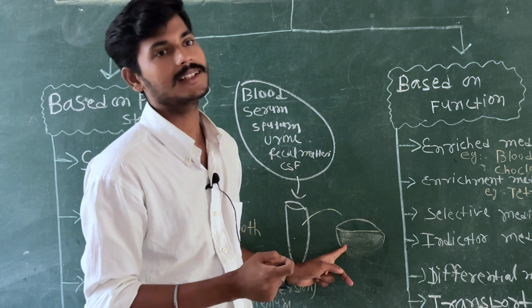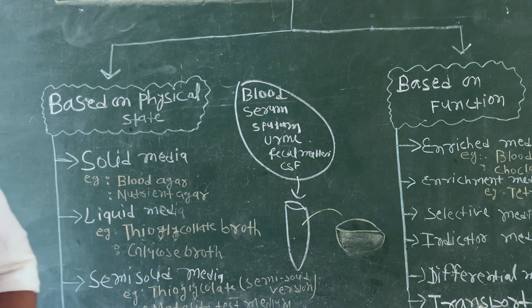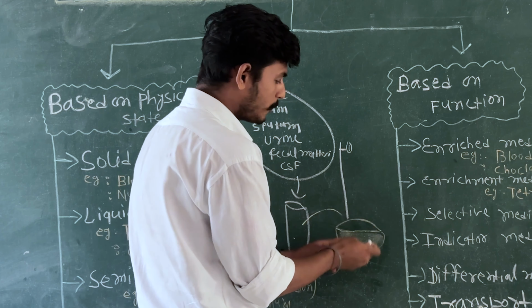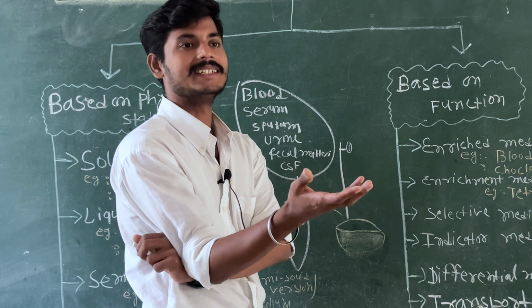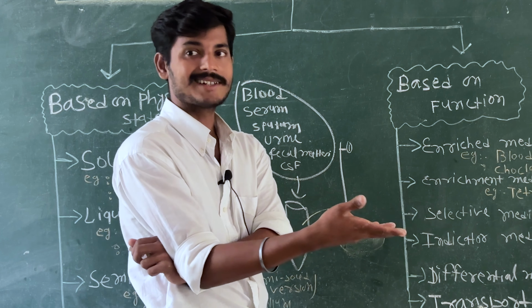Have you heard about agar? Yes. We will add many things here. Starting from first, we have to provide the nutrition. This is a simple media. Nothing is added, just a petri dish, like a small bowl. This is called the petri dish.